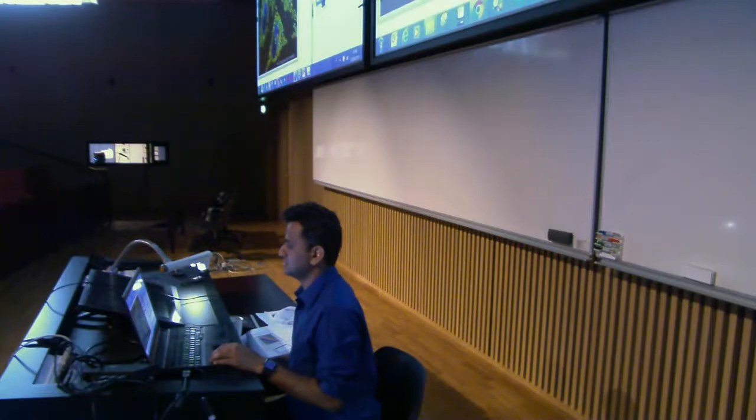You need to do the AND operation first and then press add. But we did that, right? I think you selected one. Okay, so I just delete this now. Delete. Go here. Control, more, and then say add it. Yeah, you're right. This one. Yes.